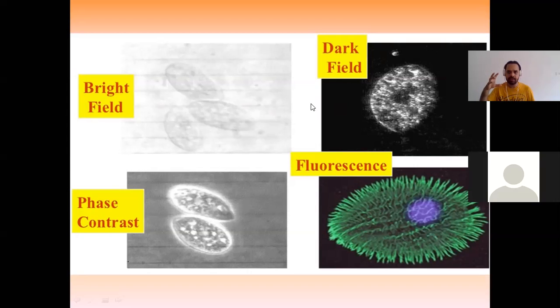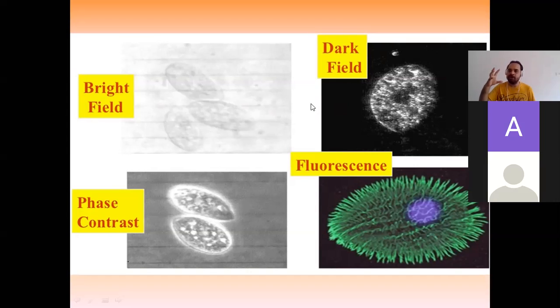So the amount of light that is being captured and again released, there will be a small fraction of time. That change in the time will result in its glowing nature. The specimen is going to shine in that area.